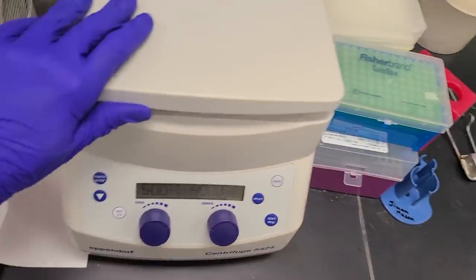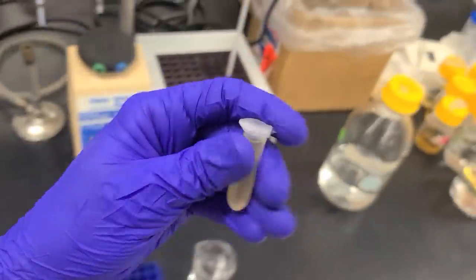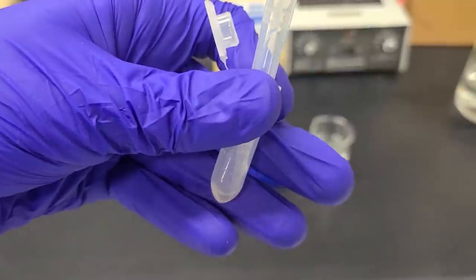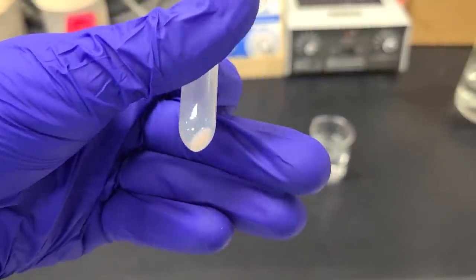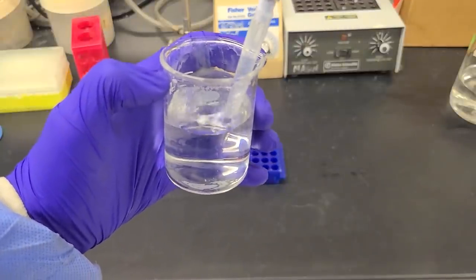It's done, let's go. All right, you see how the bacteria are all down in a clump at the bottom there. We're going to dump everything else out because we don't need it anymore. We're going to remove the last little bits of the liquid there so we just have that nice bacterial pellet at the bottom. And then we are going to mix them up with some infiltration buffer.